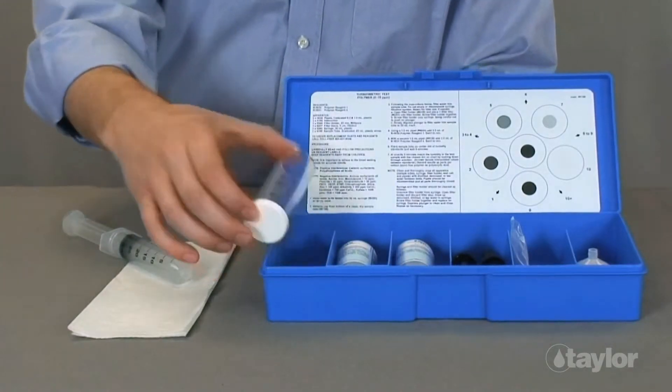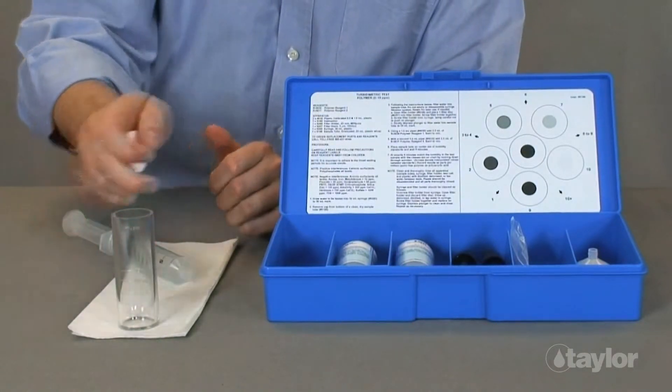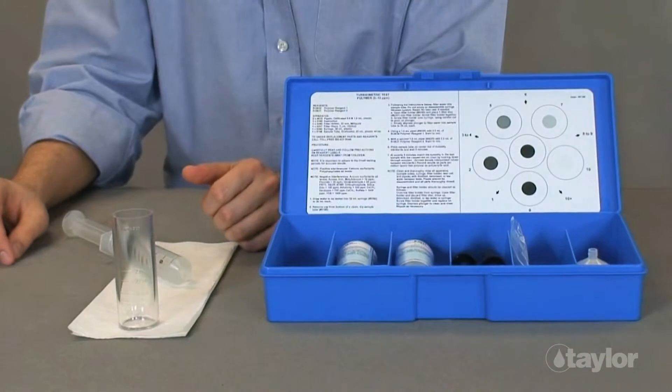First, remove the cap from the bottom of the 9198 sample tube. Make sure the sample tube is clean and dry. Set the sample tube aside momentarily.